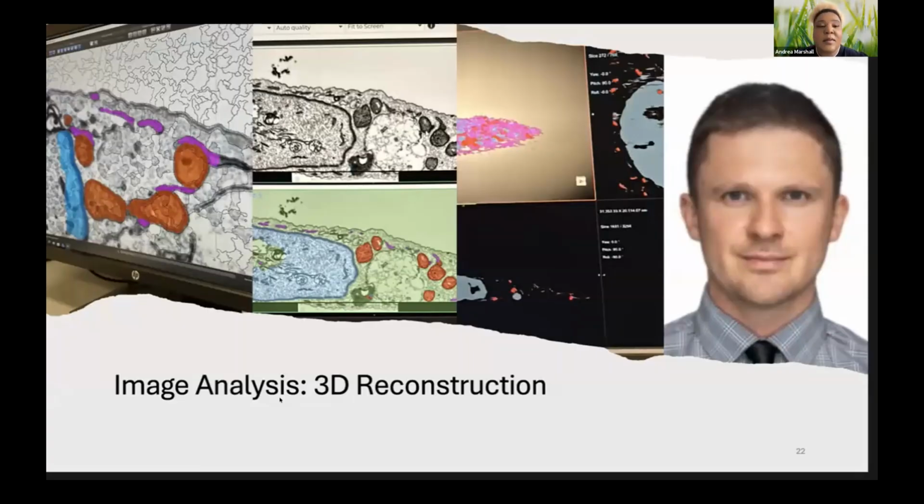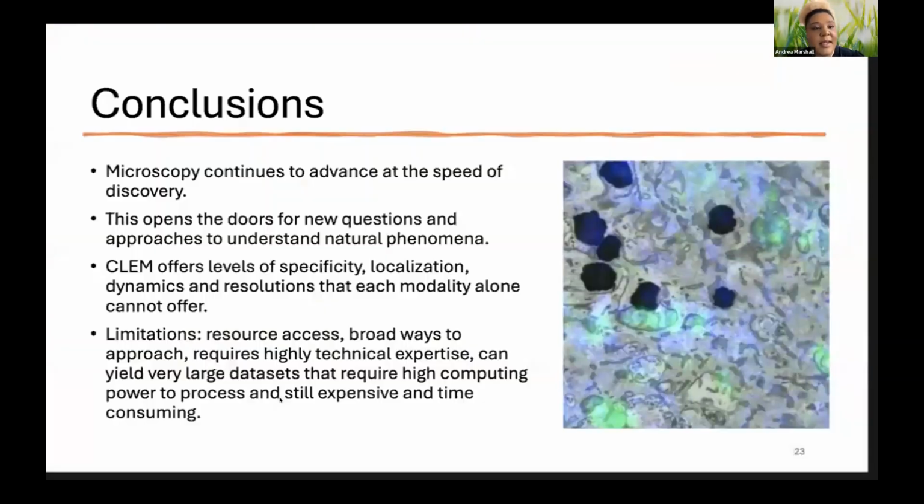And so once we got those images, the next thing we have to do, what are we going to do with the volumes? So we're currently in the process of trying out different 3D image analysis programs such as Dragonfly as well as Napari. And we are training the models to be able to identify both mitochondria as well as ER membranes so that we can do our comparison. And this is Oleg Kovtun, who has been a phenomenal help with that.